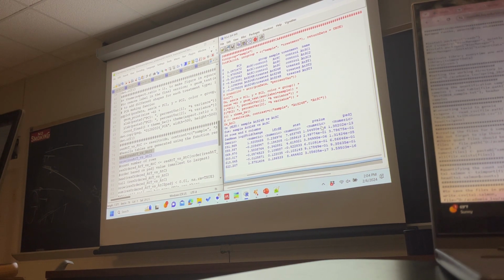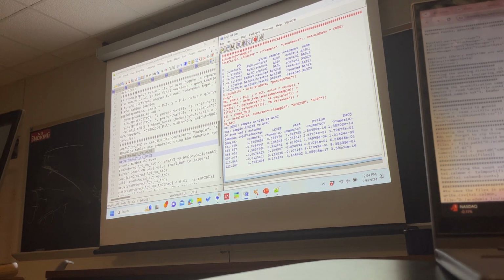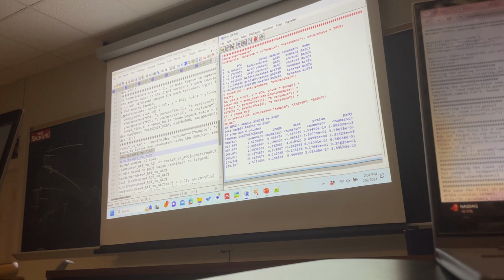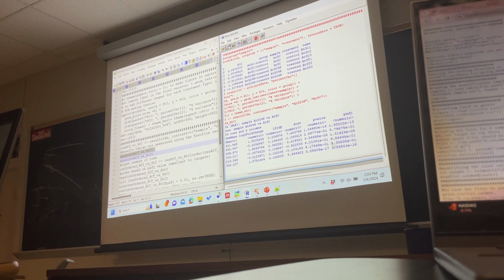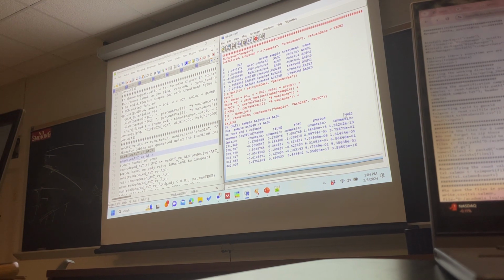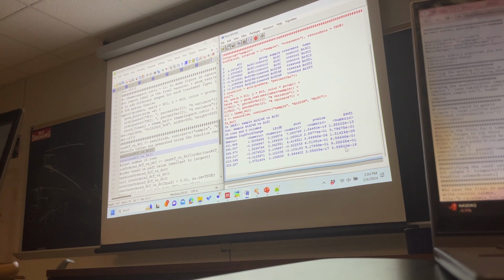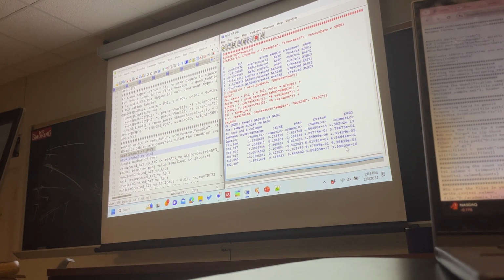It adjusted each p-value from this table. First, it sorted, and then it ranked those p-values, and then it corrected the p-value there. And this is what we use. We are going to use this to say, okay, this is the cutoff I want for my differential gene expression analysis based on the FDR.